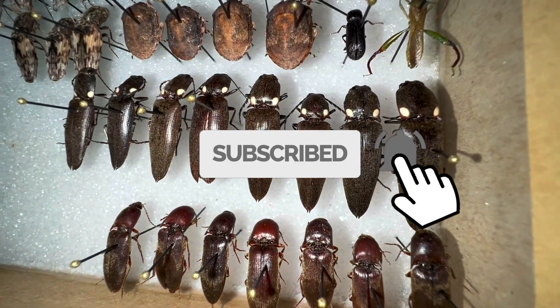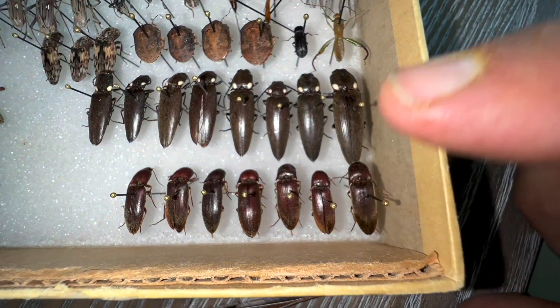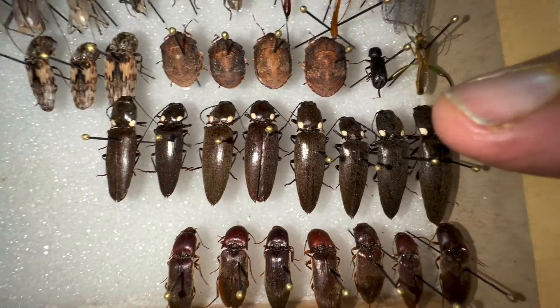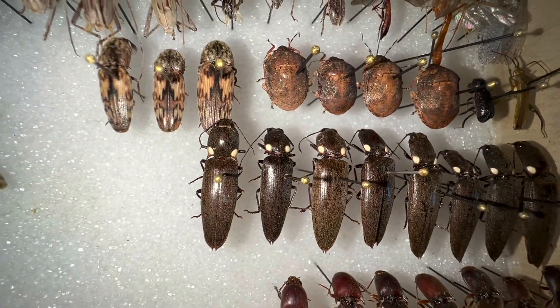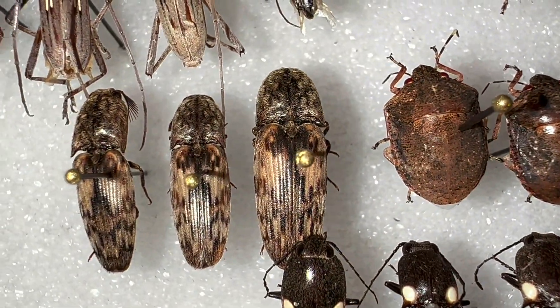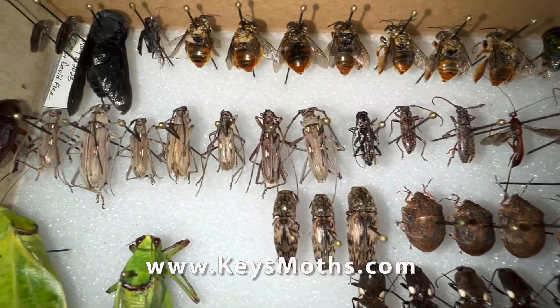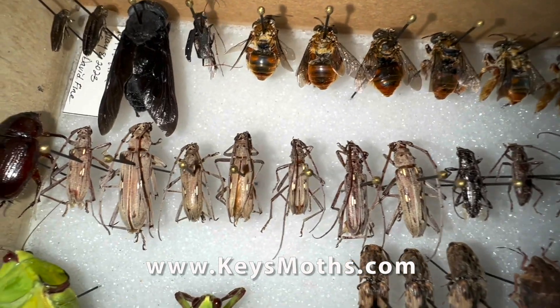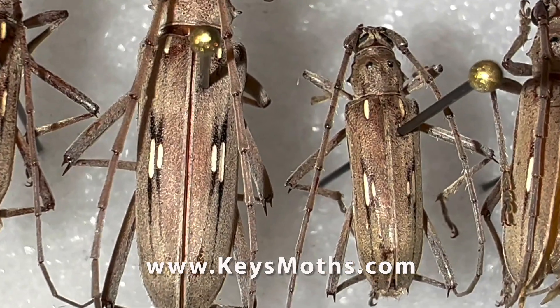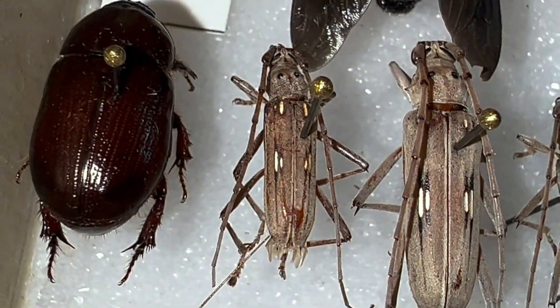I've got several different species of click beetle — this one's just kind of the brown guy. This one here has these glowing spots on their thorax. I've got another click beetle species here; I haven't identified them yet. I actually found one of the eyed click beetles. I've also got a couple of different cerambycid species — this one here has a pretty cool pattern with a gold spot and a black stripe, and that one was pretty common.